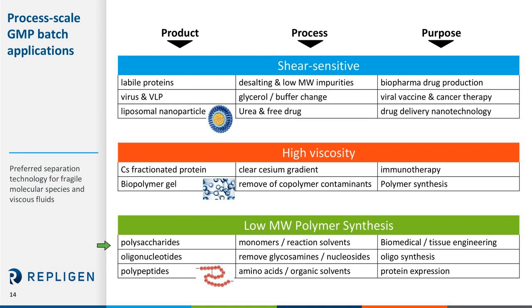So in these applications, dynamic dialysis is the preferred method over filtration because filtration simply cannot operate for viscous fluids, or it is too damaging on fragile product.